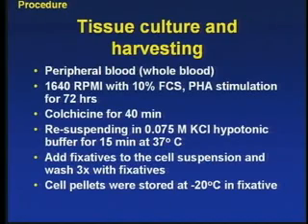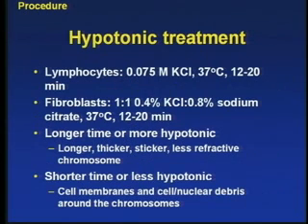Then you can store the cell pellet at minus 20 degrees. And this can be stored for a long period of time, up to a year. If you really want to be careful on this kind of thing, you have to resuspend this cell pellet into the fixative again before you do the spreading.